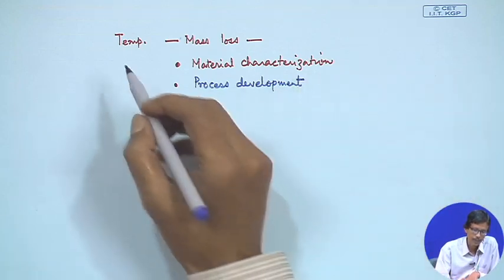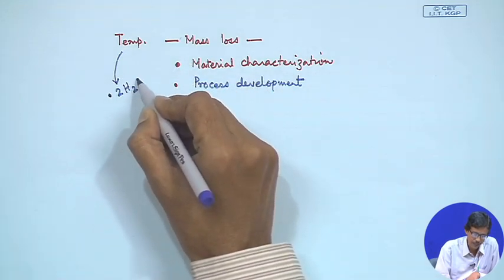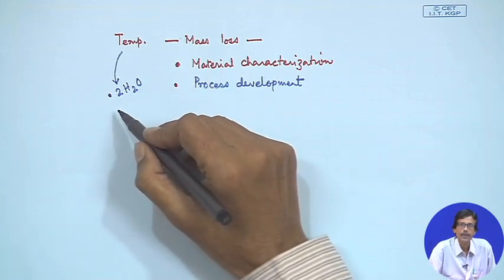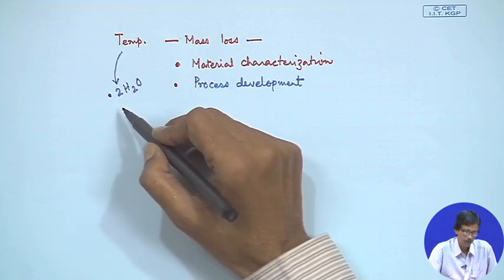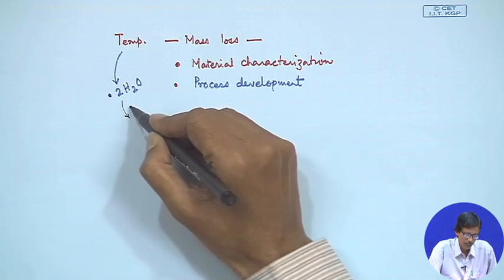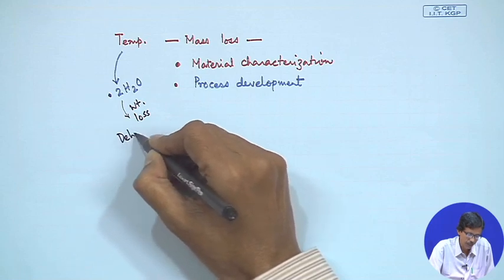And so far we have seen that you can have the water of crystallization, such as what we have discussed in the case of calcium oxalate, where two water molecules are present in the crystal lattice, nicely networked in terms of hydrogen bonding or trapped inside the voids of the crystal lattice. The removal of these will accompany the weight loss or mass loss, such that we can have the corresponding dehydrated sample.